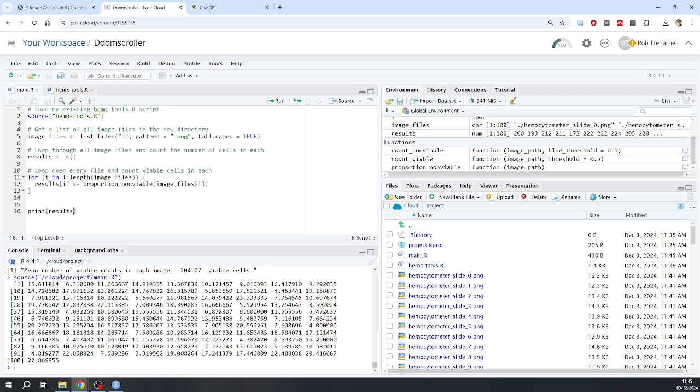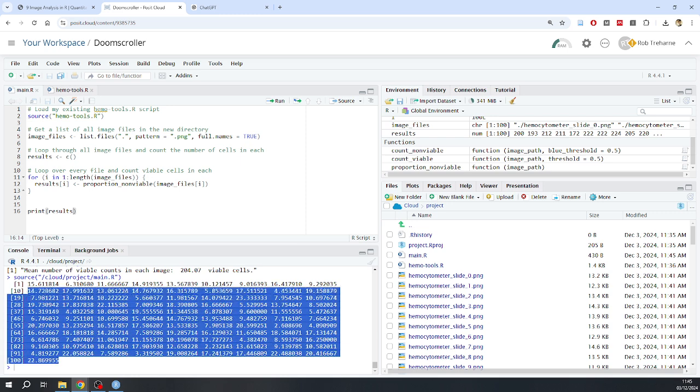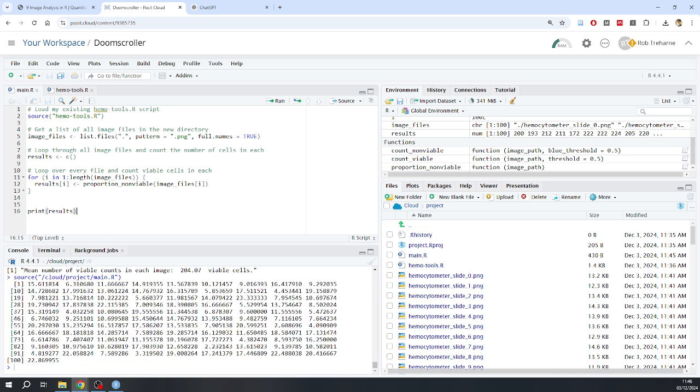Okay, now the bit that I'm not going to tell you how to do, I am going to encourage you to do it yourself, is to actually answer the question, which is how many of these values are greater than 20. So you're going to have to Google that, and that'll be the answer to this week's part 2 of the summative formative quiz. And if you check out the end of the second video for the RStudio based stuff, not the Posit Cloud, I show you exactly what to type into ChatGPT in order to do that.